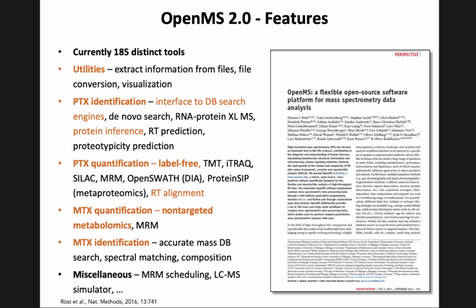They cover many different aspects, from extraction of information from files, file conversion, visualization, proteomics identification, and we're going to use the interface to database search and protein inference modules there, but there are also other things, retention time prediction, proteotypicity prediction.